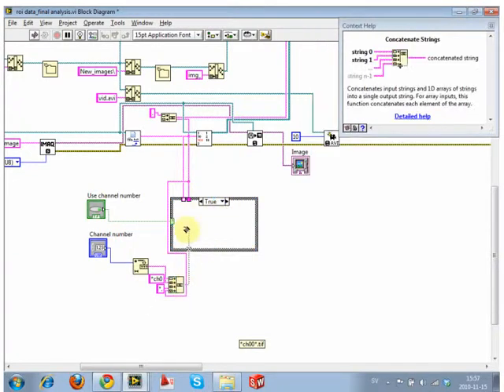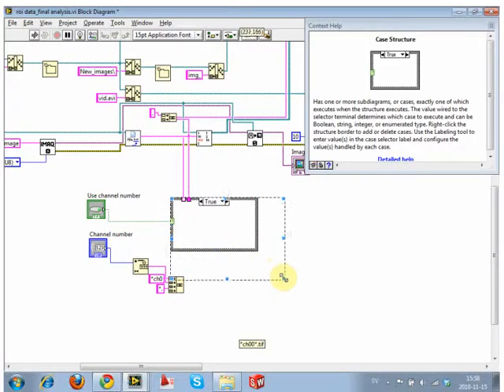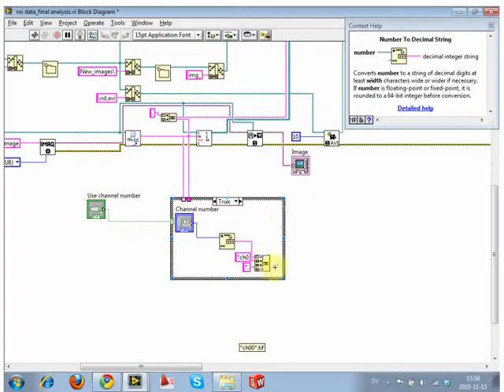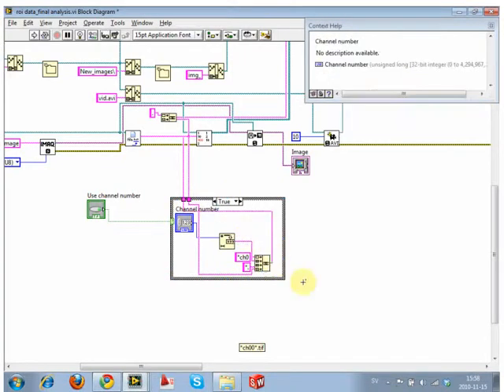So why do you use password? We don't have to. I can drag it inside now. I was just putting it in a place while I was building it. So yeah, we can drag it all inside, to make plenty of room. So this one should be the file extension. And then this is our new thing. Okay, get rid of this. Let's just stick that there so we know what it's doing.